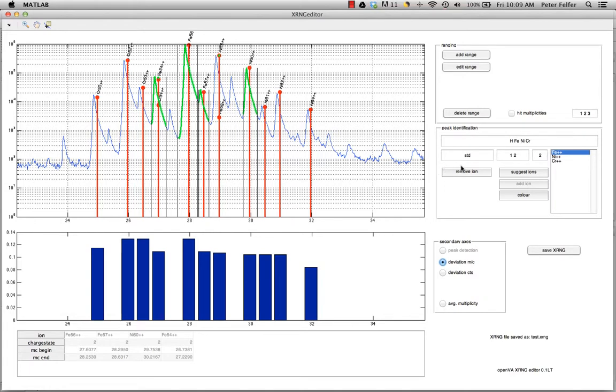And then probably the most important thing is the behavior. This part here, which is the peak identification, because you're going to be using that quite a lot. And it's actually something that I personally consider very handy, because it doesn't just allow you to have a look where certain peaks should be, but also check the isotope ratios if, of course, your element has multiple isotopes, because a lot of elements unfortunately don't. A few important elements like manganese, gold, unfortunately don't.